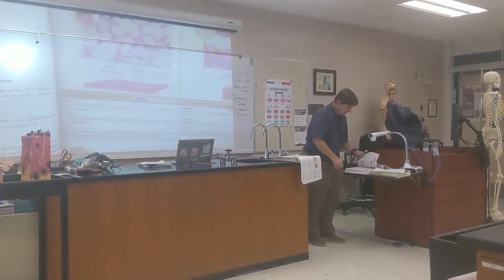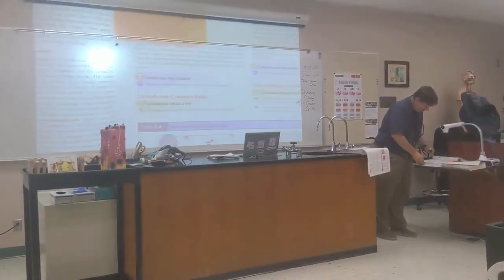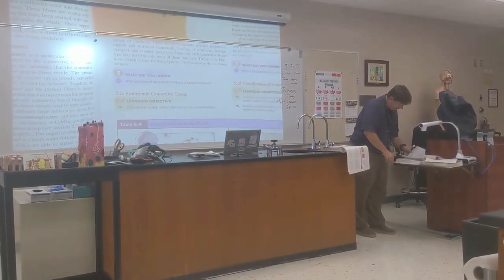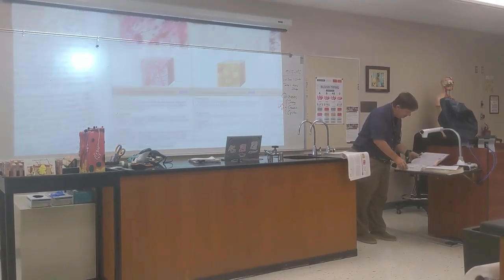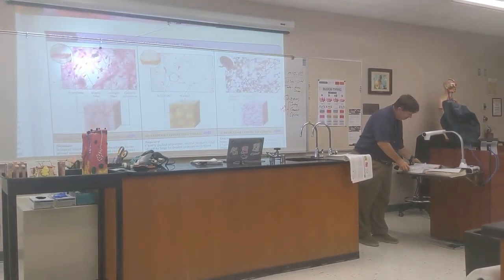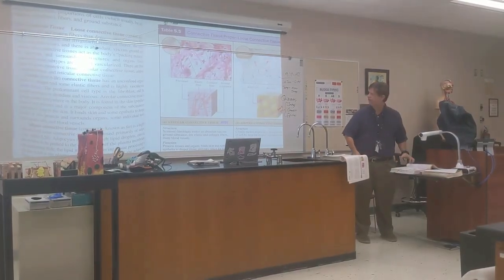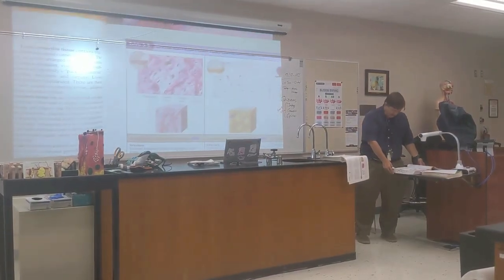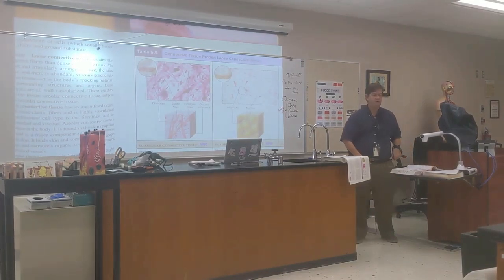Okay? So, if we're looking here, that's mesenchyme. We don't care about that. We're not testing on that. Okay, so connective tissue proper. Here we're going to have areolar tissue. This is in your textbook because they're better pictures than your lab. This is in your textbook on page 169. I would recommend writing that down in your notes so it's easy to get to.